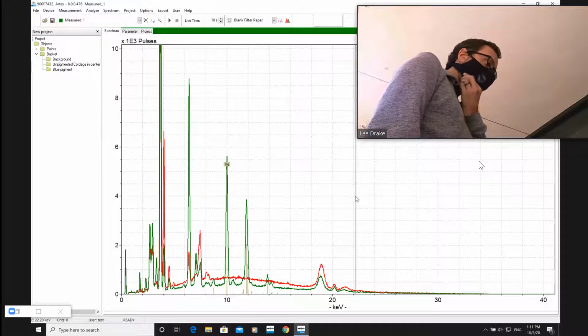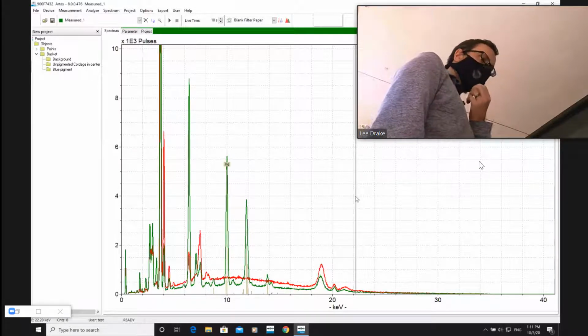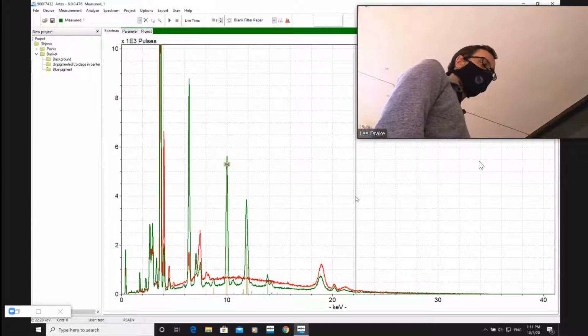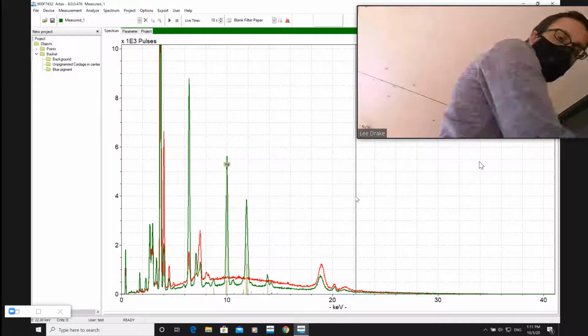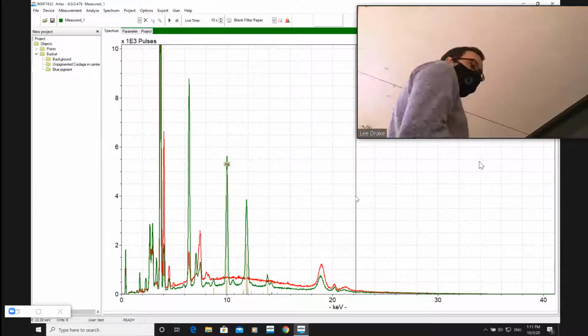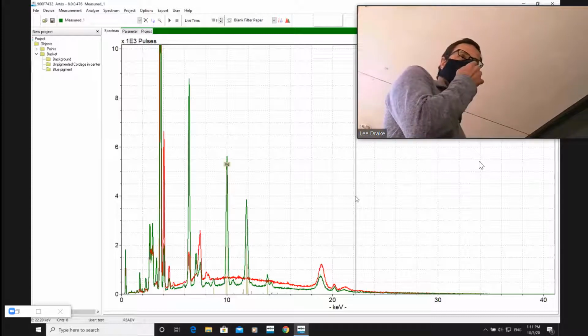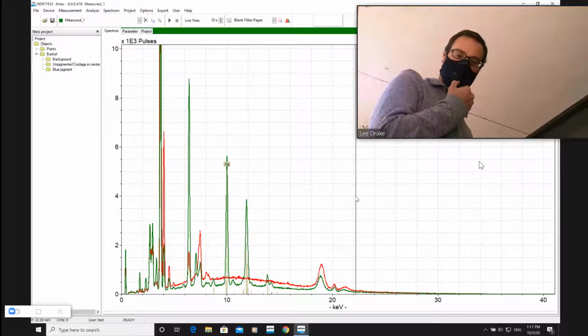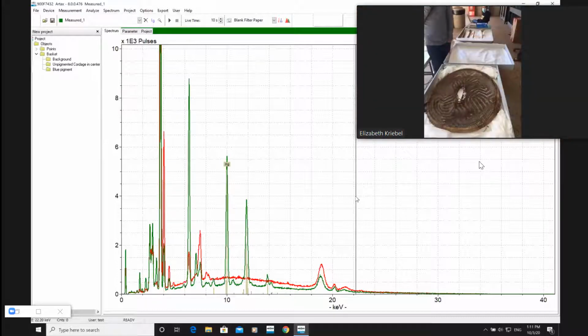So we've hit the colors, we've hit some non-colored. Anything else you feel we should test on this object to answer the toxin questions? I think the edge. Yeah, I think we'll definitely want to do the edge because it's the majority of the object. Can we switch the camera back to the basket view? Yes. I think you have to unshare your screen. Is that right or no? I do. No, I don't think we're okay. All right. Good job. You're doing fantastic. Thank you.